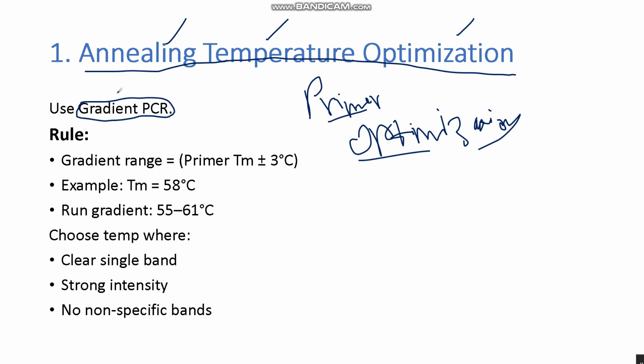If we get no results, then we go towards touchdown PCR.